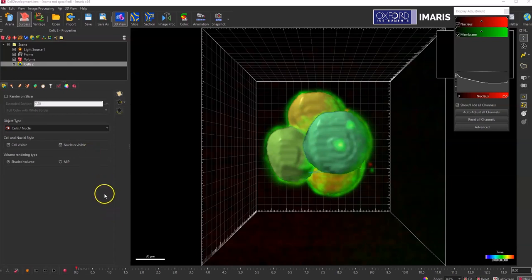All right, so to make a subsection from cells or subpopulation from cells, we're going to first create a copy of this original cells object, so duplicate it. If you don't need the original population of cells, then you can skip this step, but I think it's nice just to leave the original ones alone.